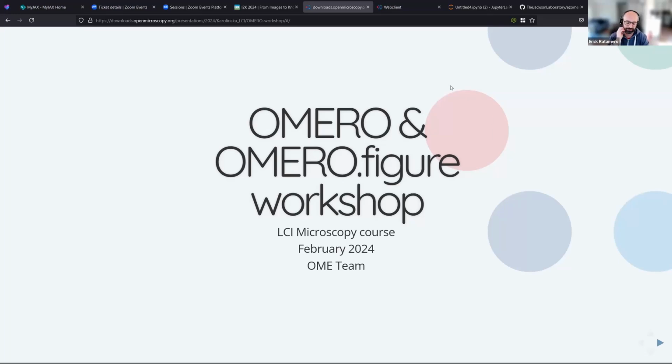Yeah, so I started just being the person who was the admin for an OMERO server. Eventually, when I moved here for this job, I started developing a bunch of functions for doing common things in Python. And that turned into ezomero, which is the main thing we're going to talk about today. And I ended up developing a few other OMERO utilities around the main service.